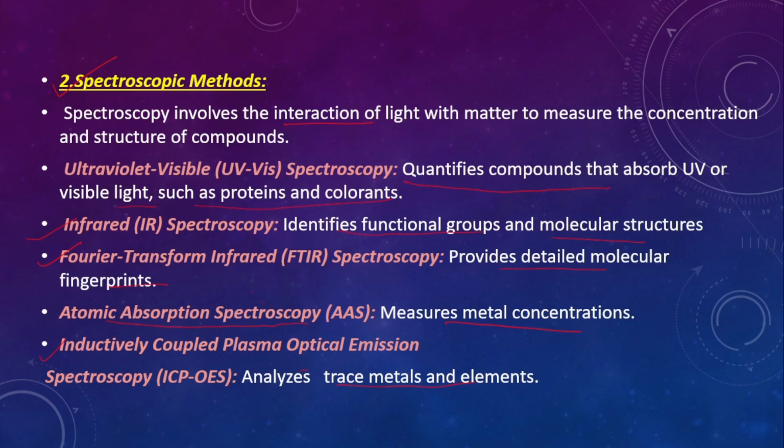X-ray fluorescence spectroscopy is used in determination of the mineral content in food, that is calcium, potassium, etc., detection of heavy metal contamination like lead and cadmium, and quality control in food packaging materials by analyzing the elemental composition.